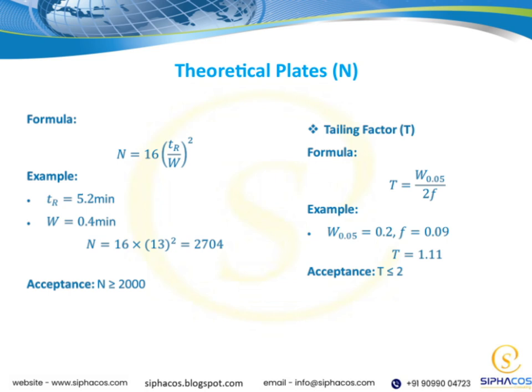The more plates we have, the more times the mixture is effectively, repeatedly refined, leading to better separation. The key point here is that the number of theoretical plates, N, is directly related to the efficiency of our column. A higher N indicates a more efficient separation, meaning our components are more distinctly separated with less overlap. This is crucial for achieving pure, well-defined products, especially in complex mixtures.